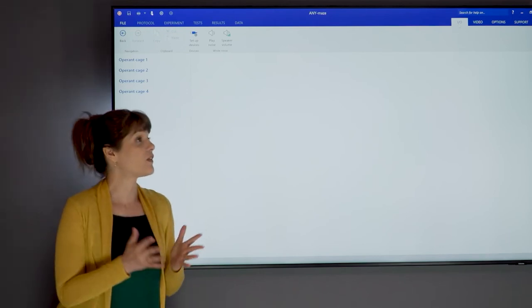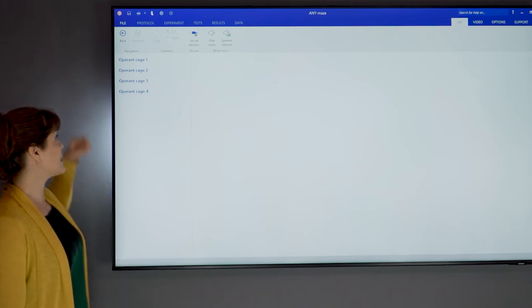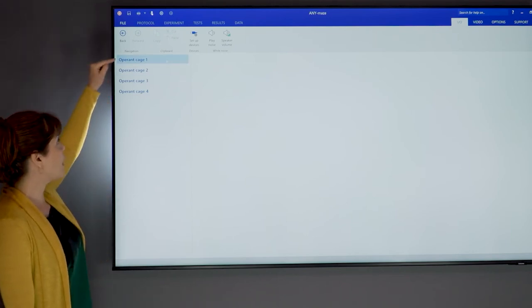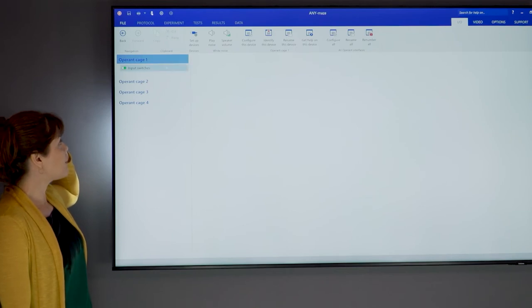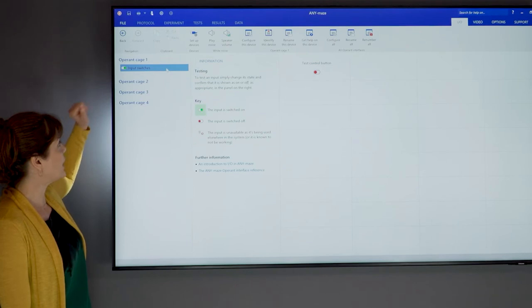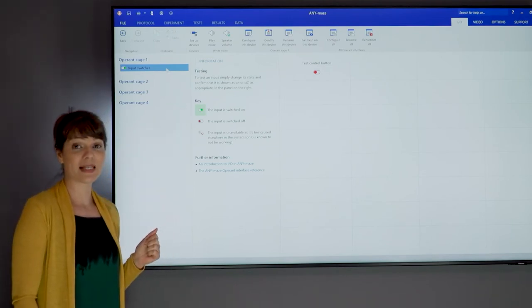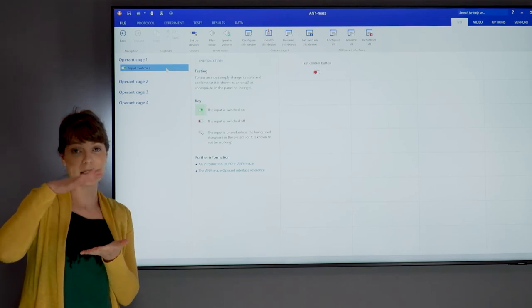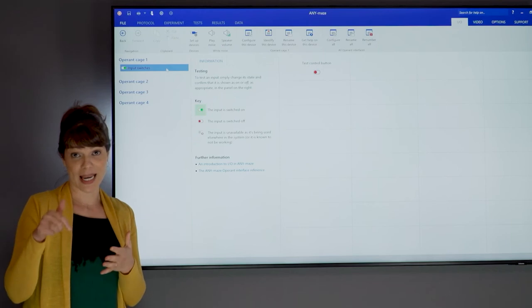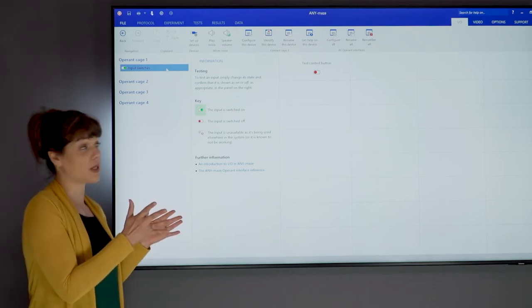You see, Anymaze has already detected that there are cages connected to the computer, and it's listing them here on the left. If we click on the first one, we can see a list of items which it connects to. At the moment, we only have one input switch, which is actually the test control button. This is the red button that is at the top of the interface, and it's used to start tests in the cage. Now we're just going to use it to test to see if everything is working.